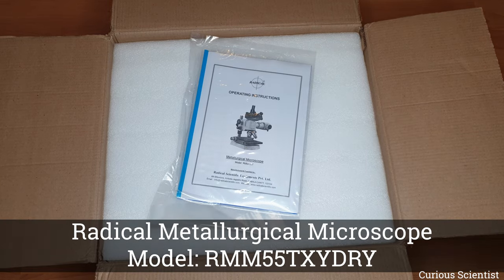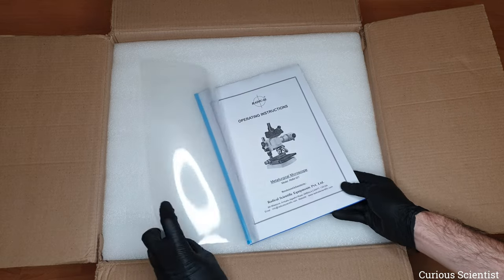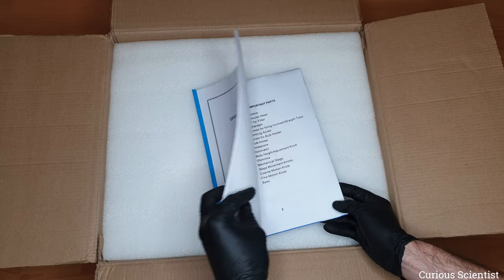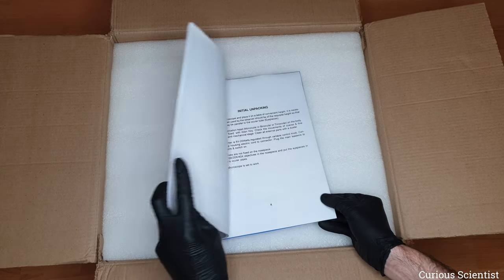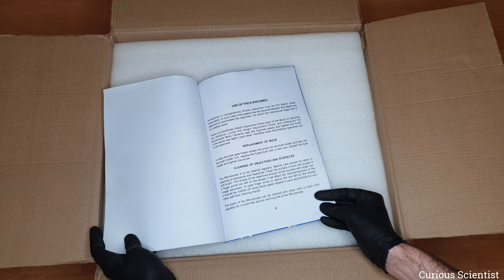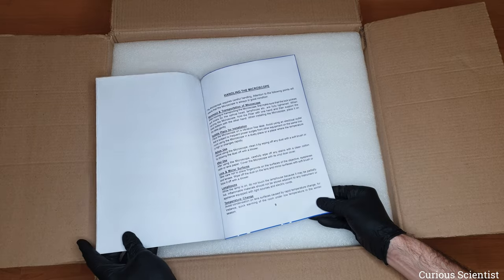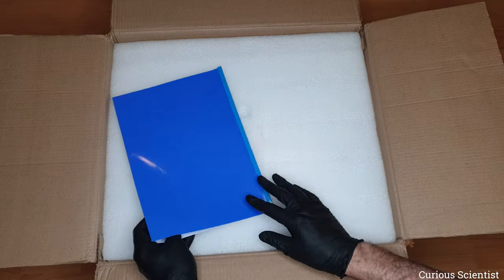This specific instrument is the RM55TX model. If we look into its instructions we can see the following things: the contents, an introduction, applications of the microscope, names of the instrument parts with a picture, unpacking instructions, how to adjust the different parts, user instructions, description of the lenses, maintenance and handling advice from the manufacturer, and some Q&A.